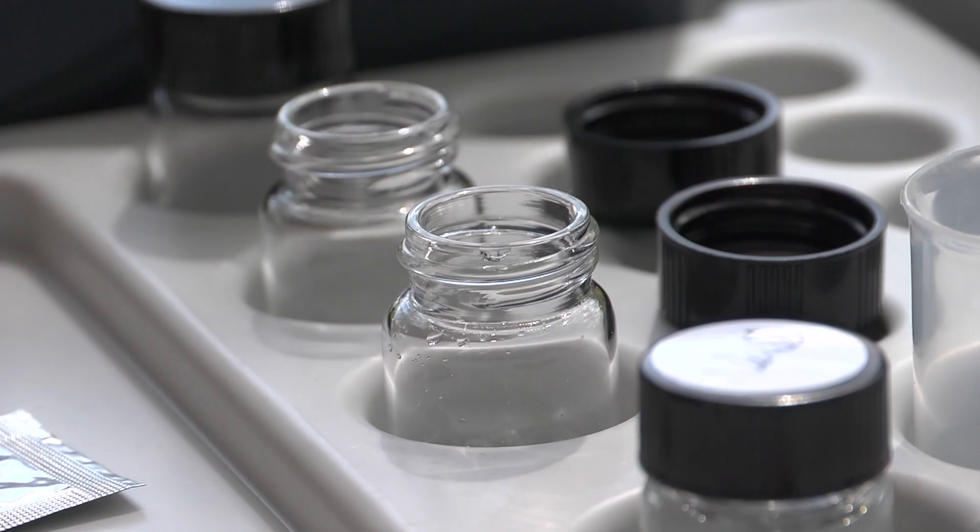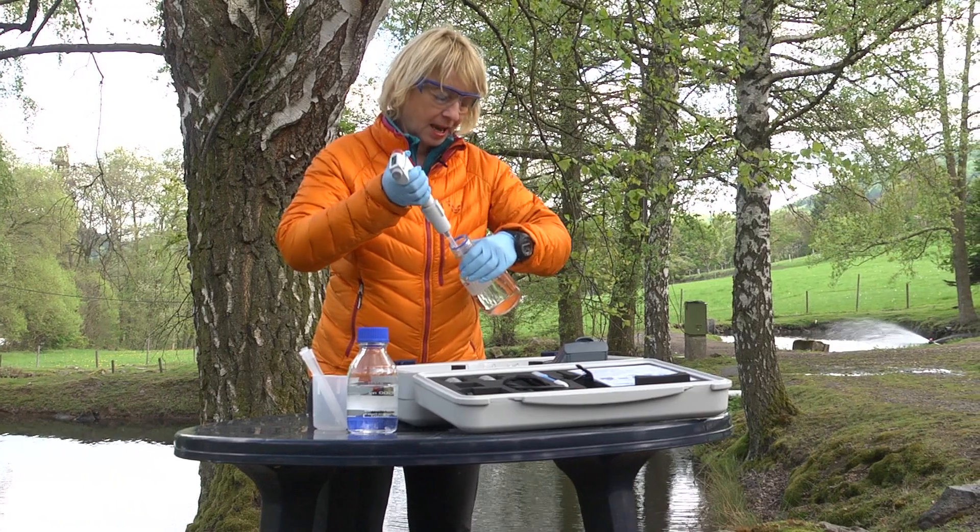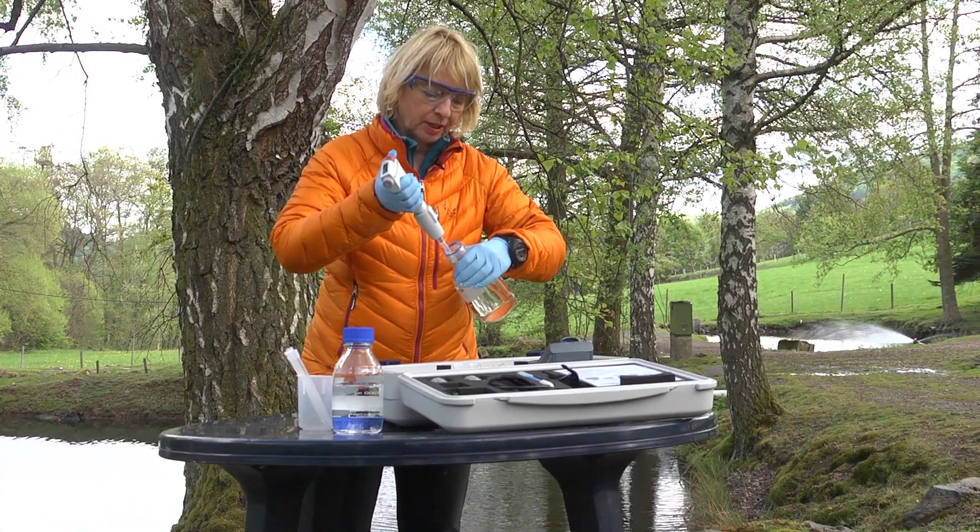We are going to perform a phosphate test and pipette a 10 ml sample into each vial. It is recommended to perform a duplicate reading so that any rogue readings can be detected.